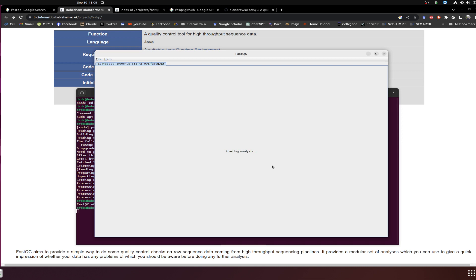The processing time depends on the size of your files. For a 5 GB file, it will run quickly. For a 20 GB file, it will take more time. Running 20 million bulk RNA-seq reads produces a file around 5 or 6 GB, which runs fast. For 100 million reads, it will take more time. Single-cell sequencing files are also very heavy and will take some time to process.